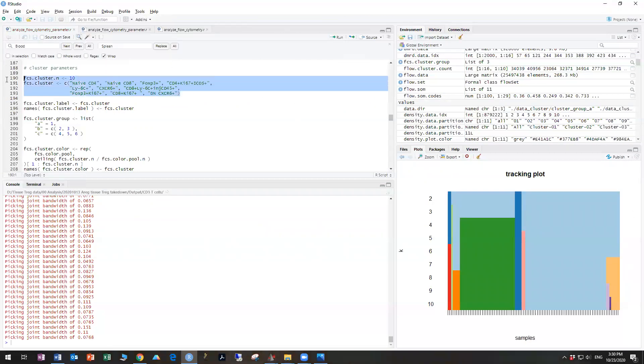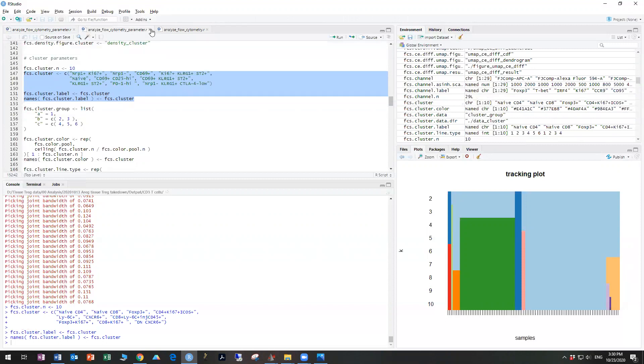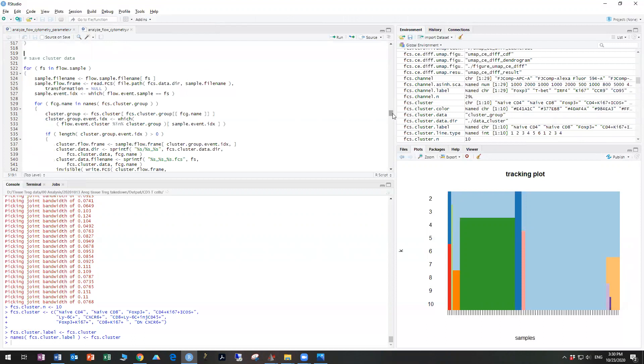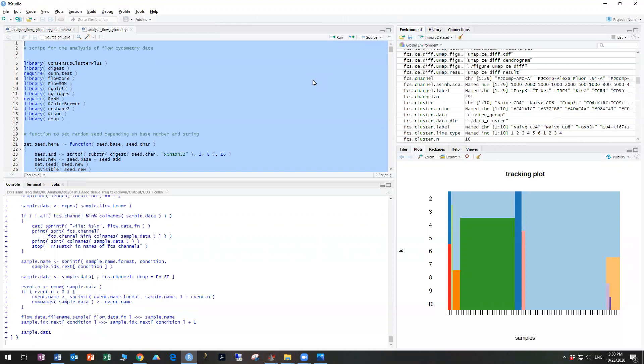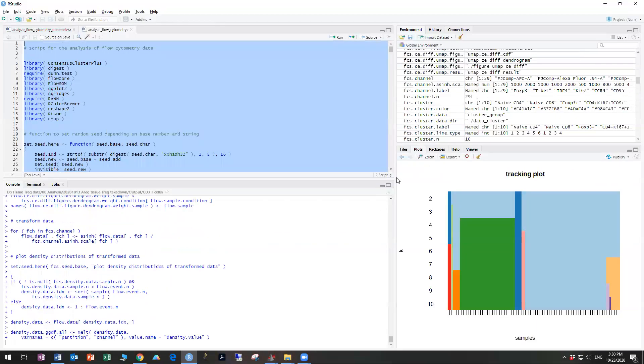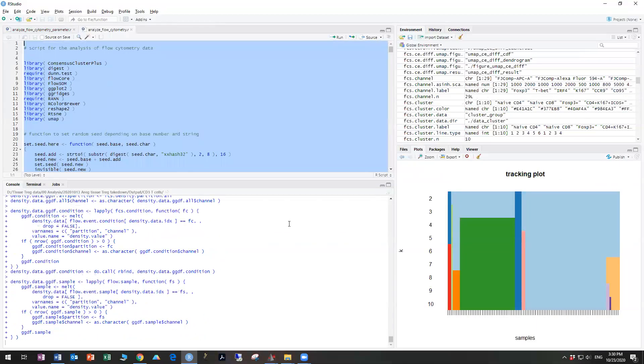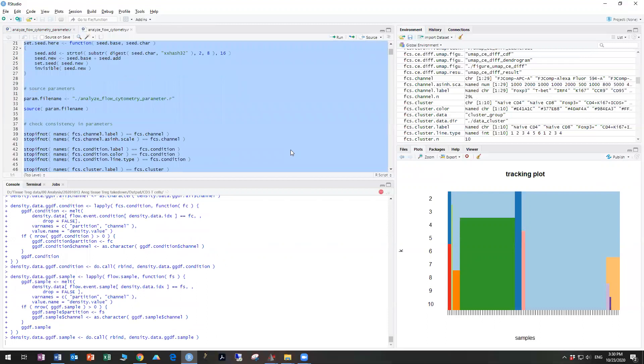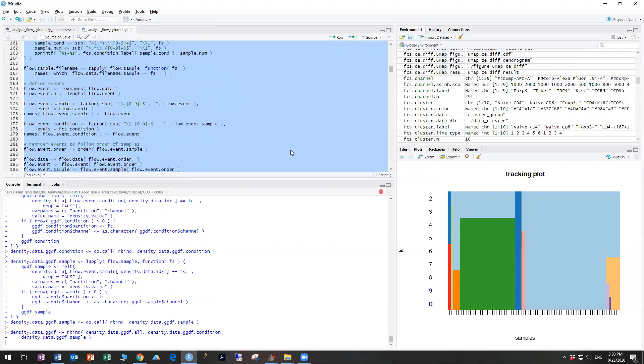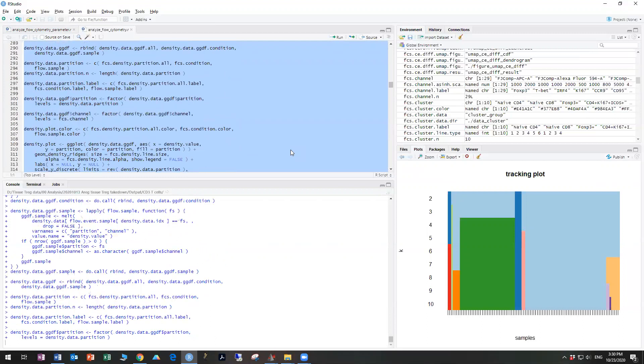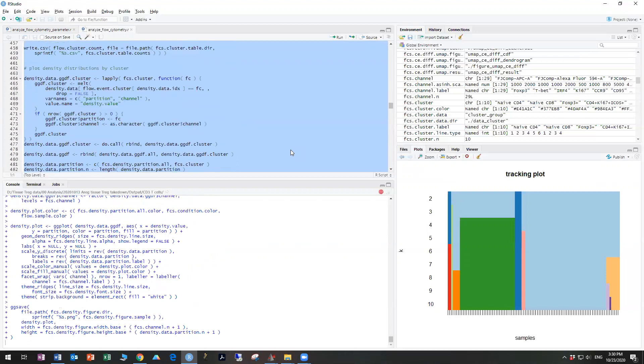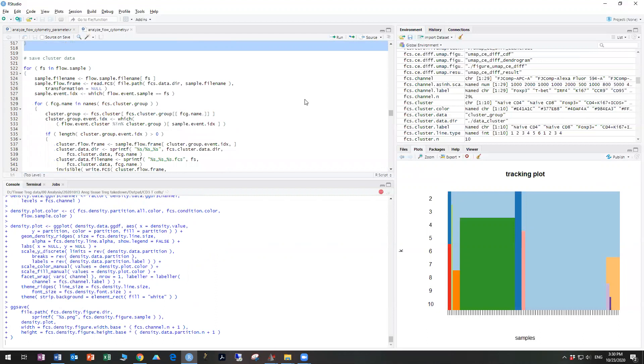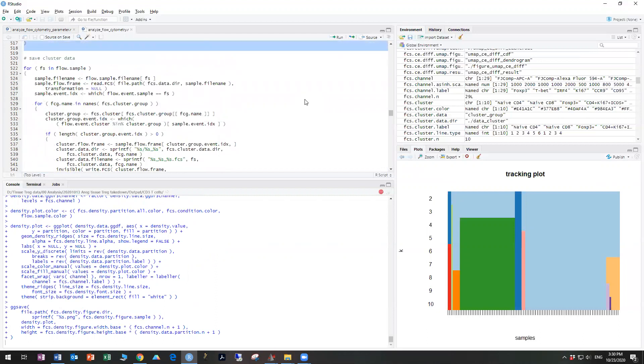We want to take this whole section. And command enter that. Close the other one. And then we want to go back up to the top. And run the whole script again to that point.